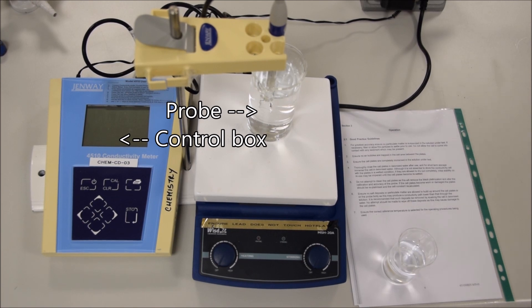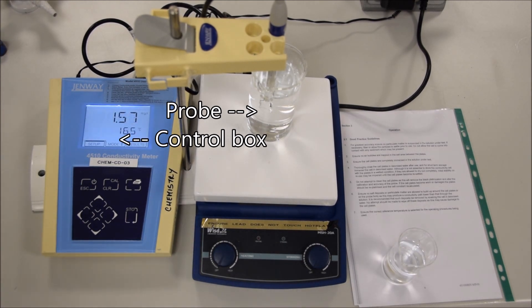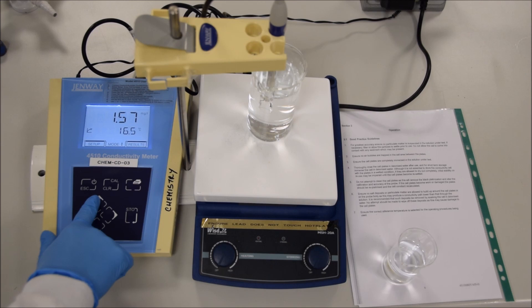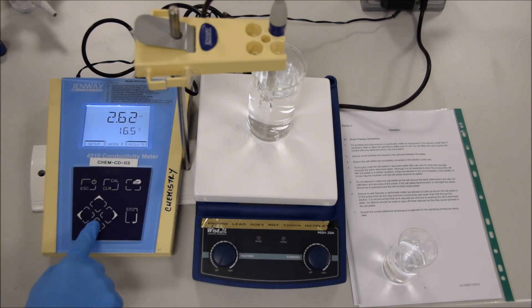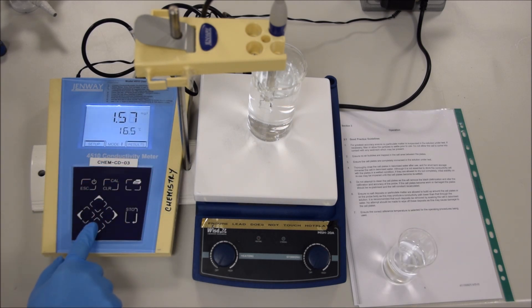This is a short introduction to the conductivity meter. The conductivity meter is going to look something like this. It basically has two components: a probe and a control box. And if we turn it on, we can see that it immediately measures the conductivity between the two sides of the probe. That's given usually in the units of Siemens, but you have to make sure that your units are set right because it will alternatively convert that into milligrams per litre, depending on your circumstance.